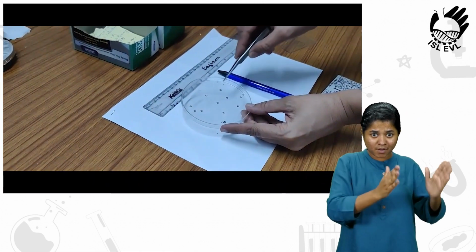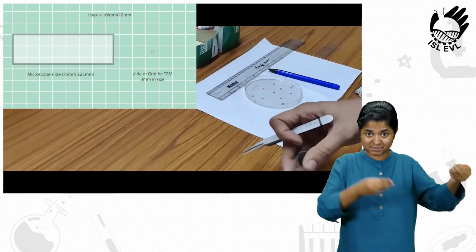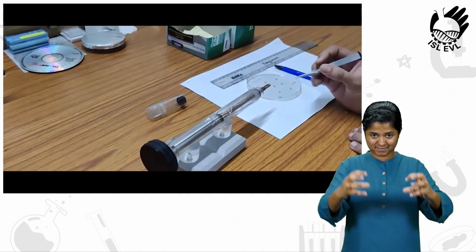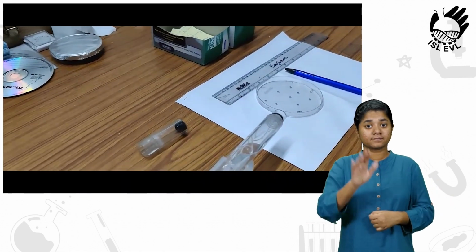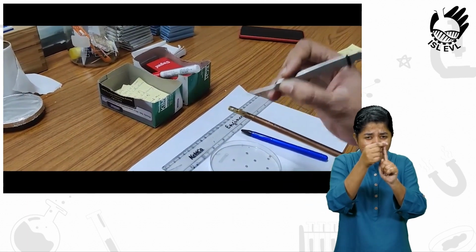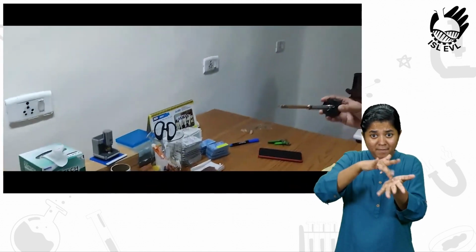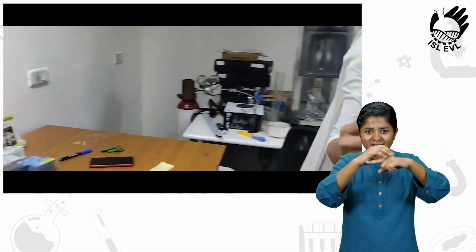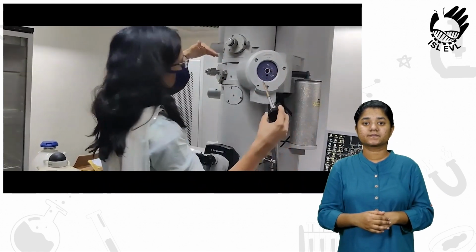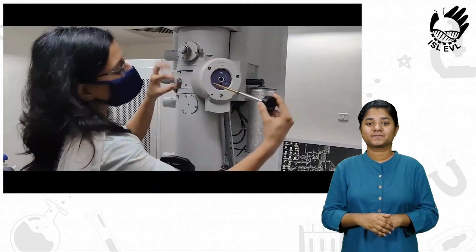These different circles, these are 3 millimeter circles. This is equivalent of a slide. This grid on which we keep the sample now goes on this grid holder. If you see it very carefully, you will see a very small tiny hole which is exactly 3 millimeter, which fits this grid onto this, and once you place your grid, which now contains your sample, this goes straight into this place, and this goes all the way down into this, and what you can actually see after inserting it is just this. The entire rod goes inside.